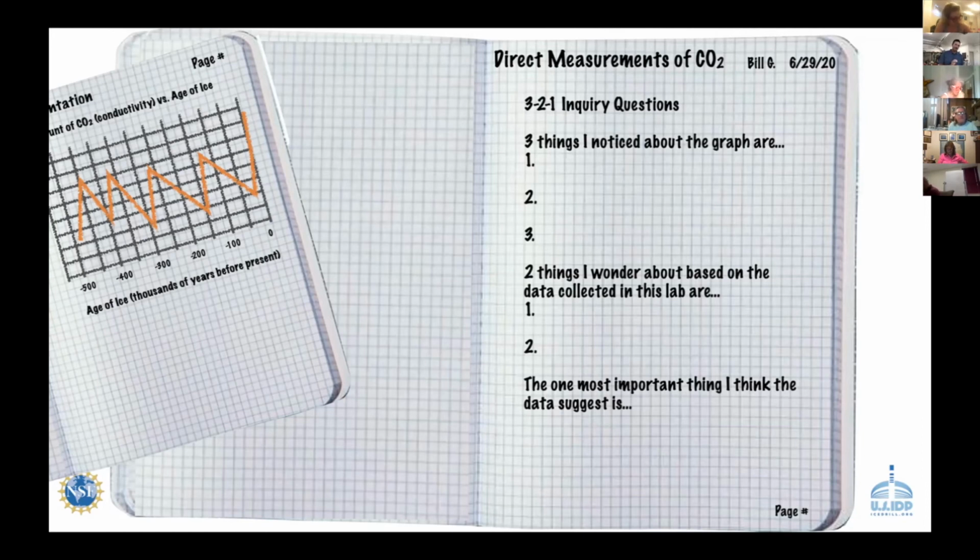Now, here's where I would tell you that you can't go wrong as long as you have distilled or deionized water. With the seltzer water, like we use pure seltzer water, this is just carbon dioxide and water. So if you had used distilled or deionized water, any conductivity is going to be completely from the carbon dioxide. Now, if you can't get this, say for example, you try it with Perrier water, you're still going to get a graph that looks like mine as long as you dilute it with distilled water. But now most of your conductivity is going to be coming from the dissolved minerals. So now it might fall into the category of never let the truth stand in the way of a good story.